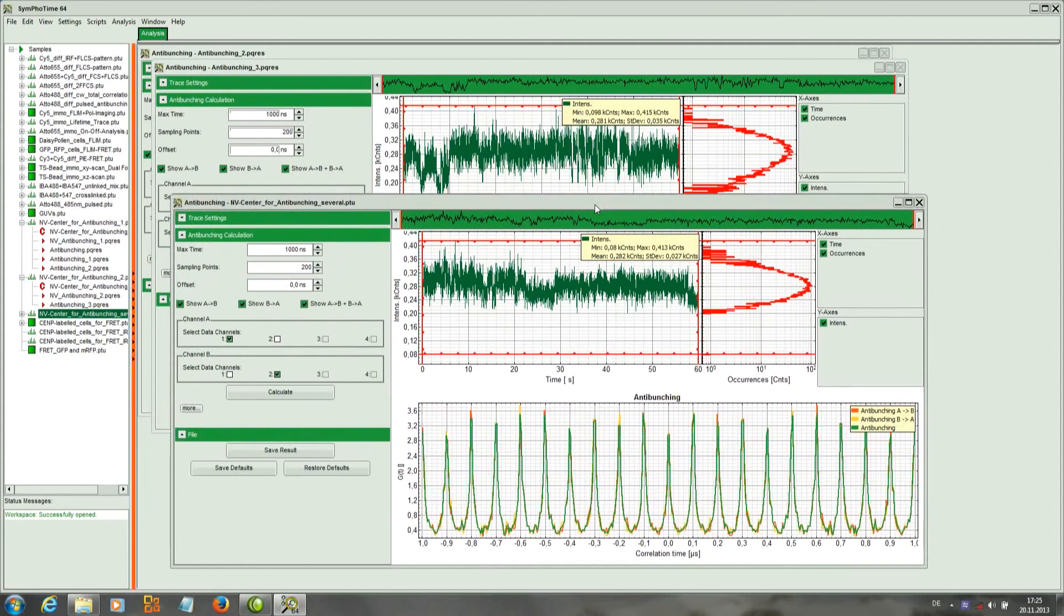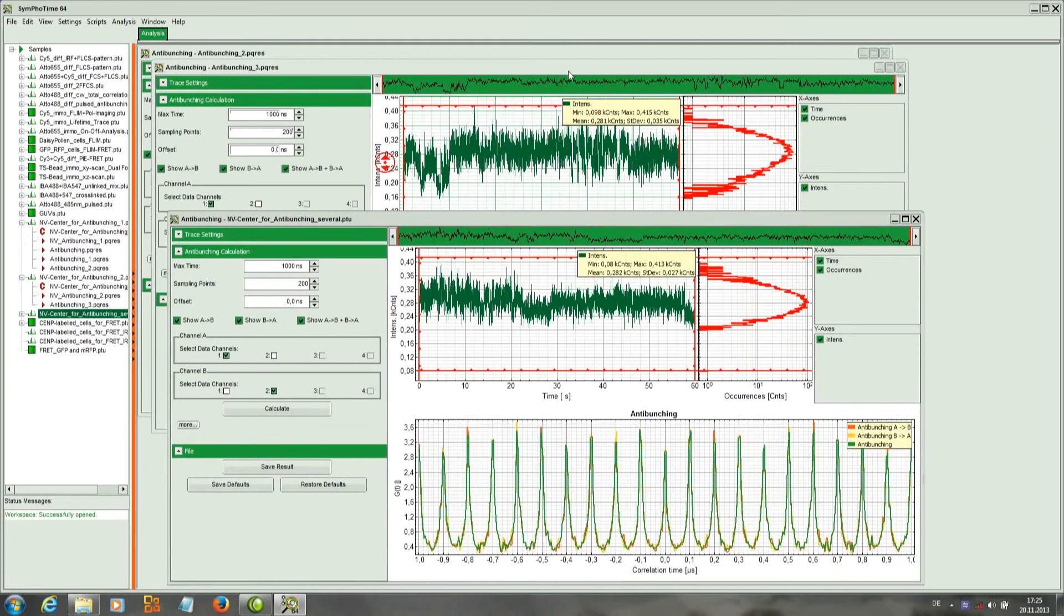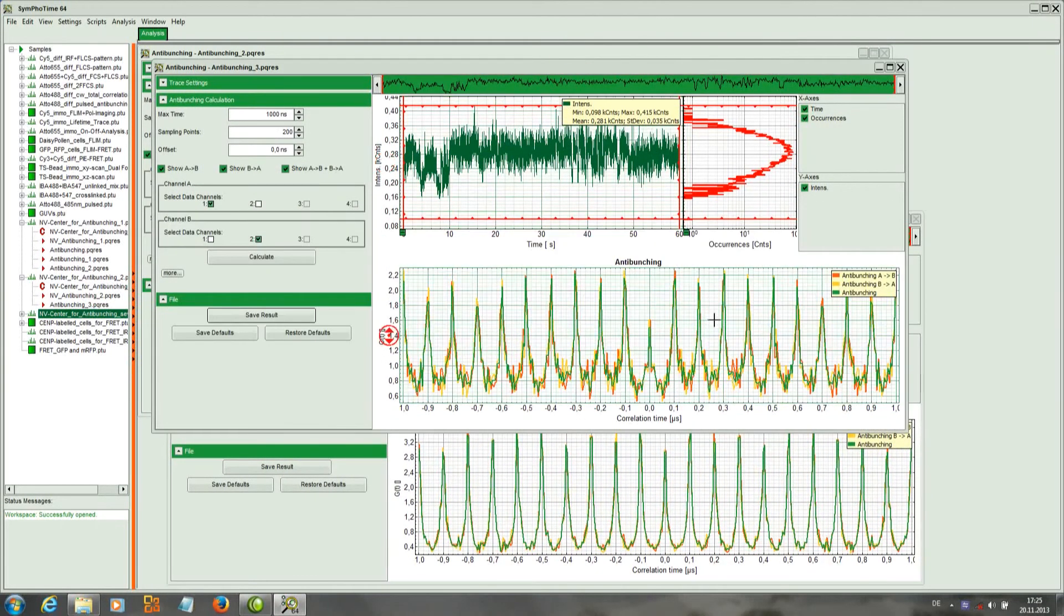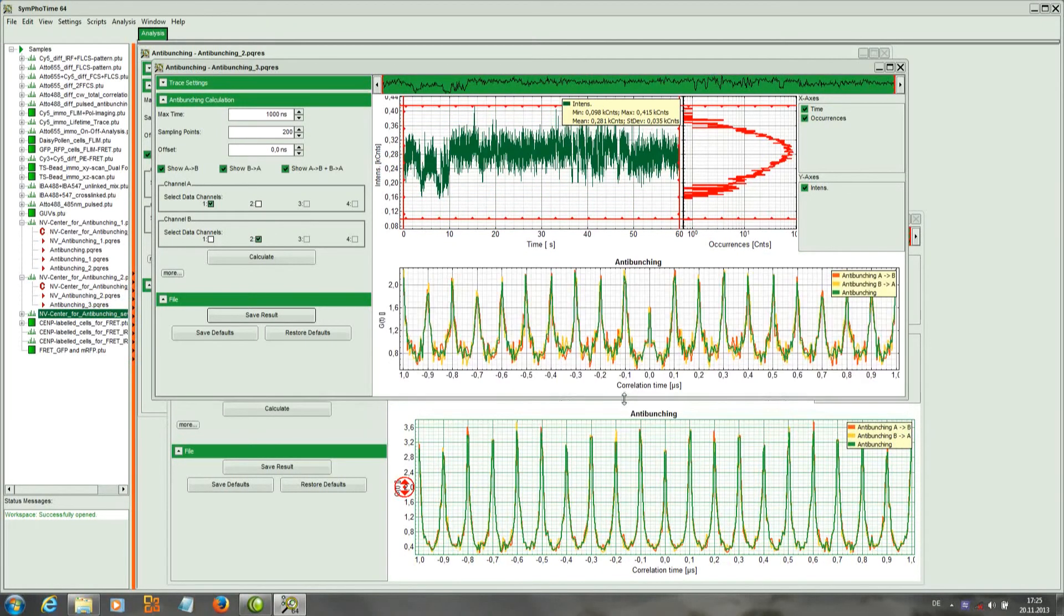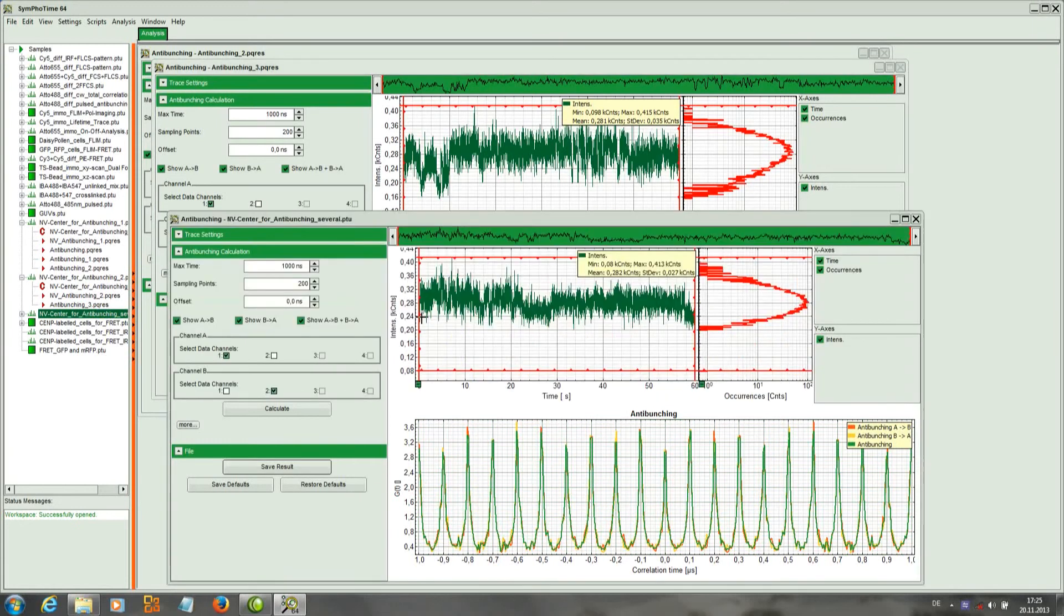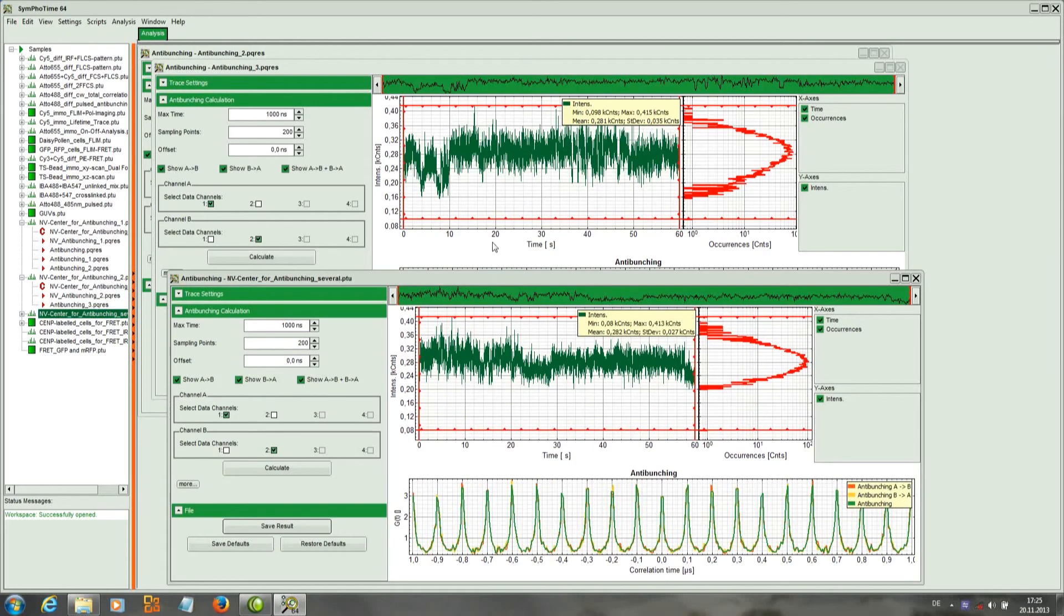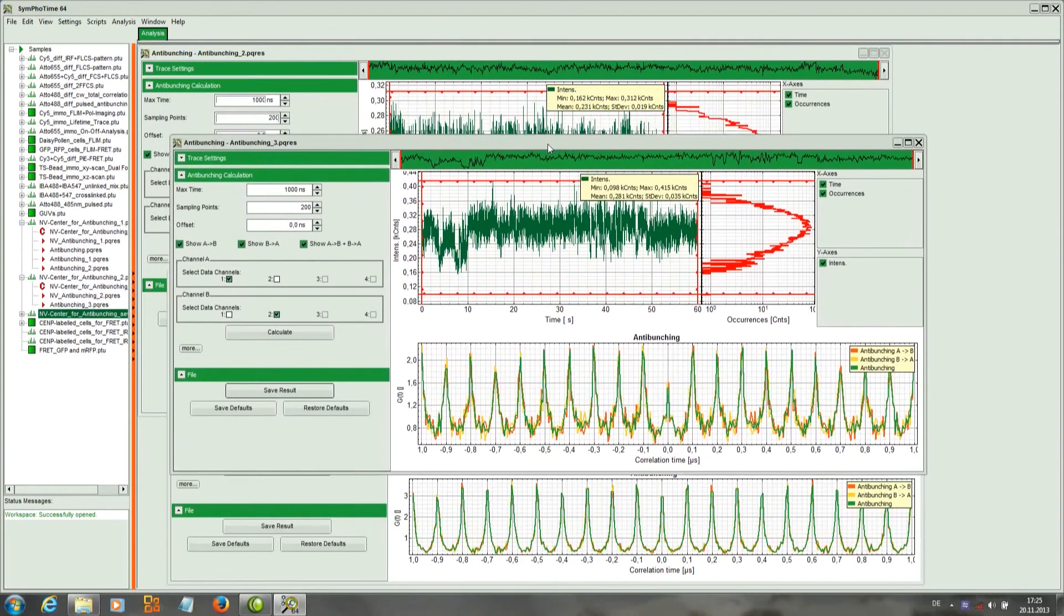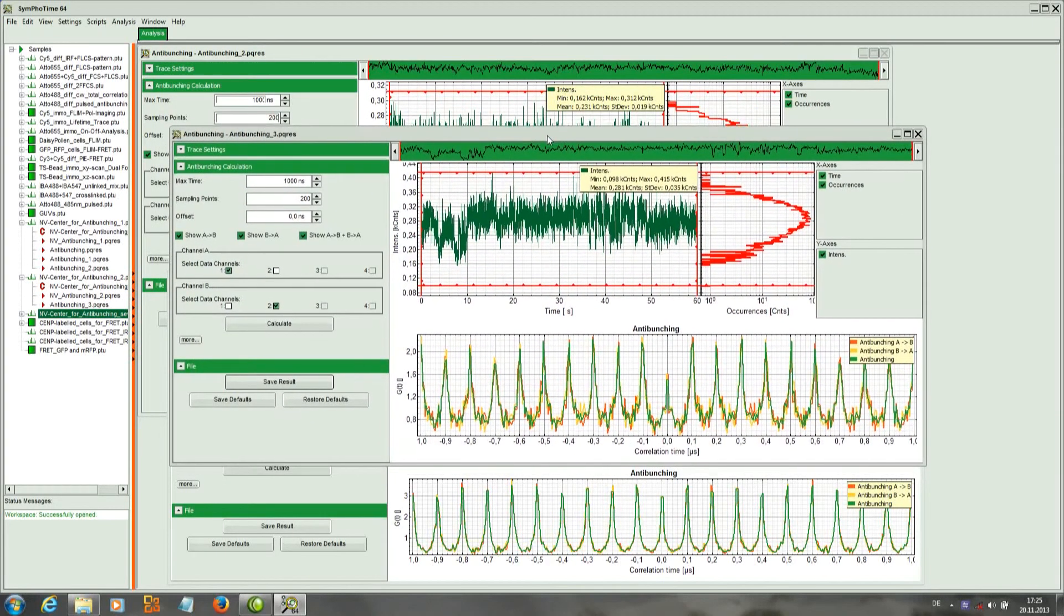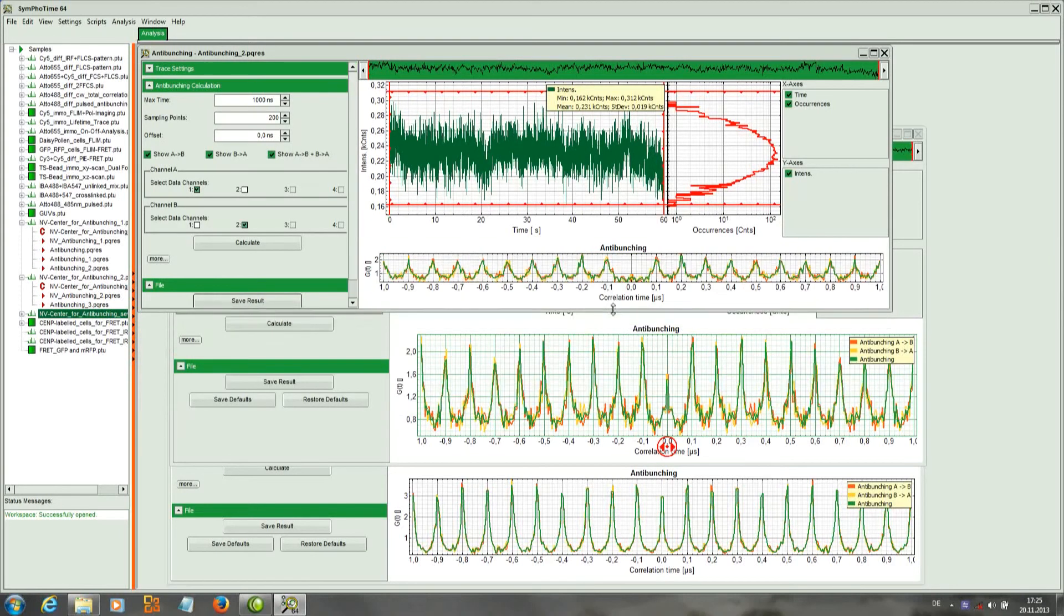So for better demonstration I just overlay these three curves. Just to enhance the differences that you can get and the information that you can get with the anti-bunching measurement. So these data have to be acquired in T2 mode.